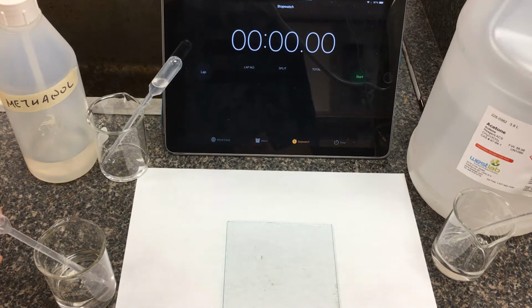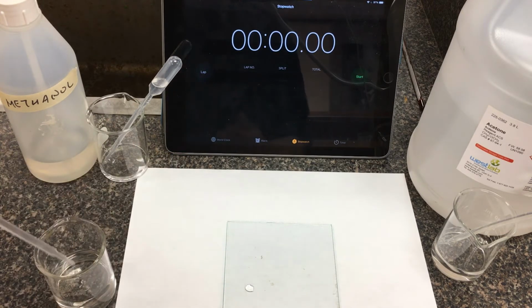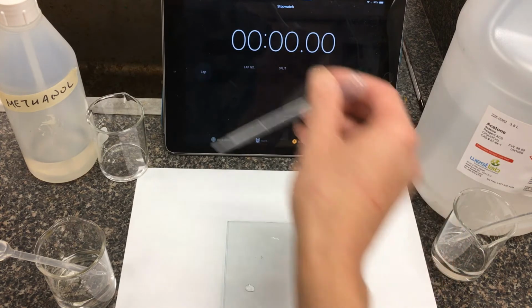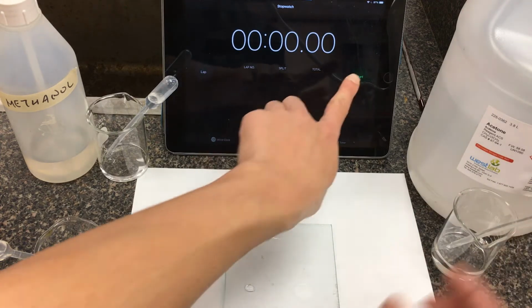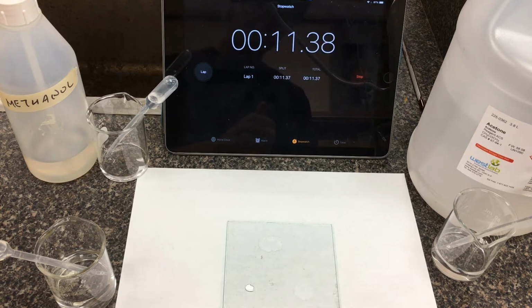So I'm going to start off here with the water solution. Just a droplet of water holds its shape very well here. We have methanol, I'm just going to leave on top. And then we're going to have our acetone solution. Okay, I'm going to start my stopwatch here and we're going to make a qualitative comparison of which one seems to evaporate most quickly. Hopefully it's clear on the video here, but if not, I'll be the judge of when it looks like these droplets are gone.